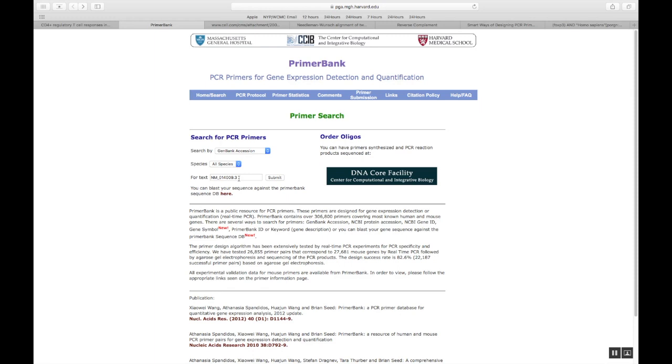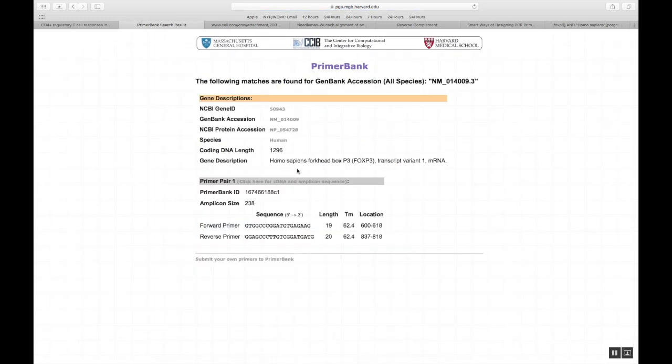As of now, I entered my accession number for FOXP3 and I say submit. And this is one site. What they do is that all these primers, the sequences that they display here, they have already tested it. They also run gels. They take an amplicon. They also sequence it. So you're sure that these primers are going to work.